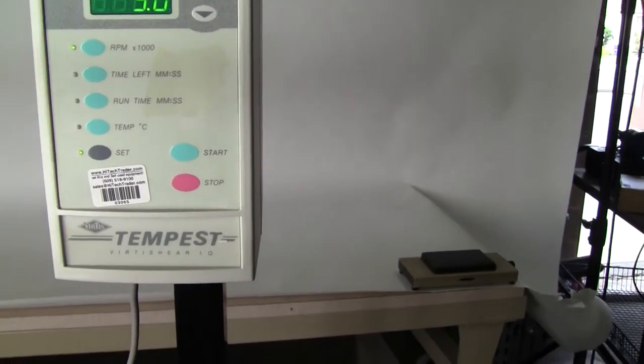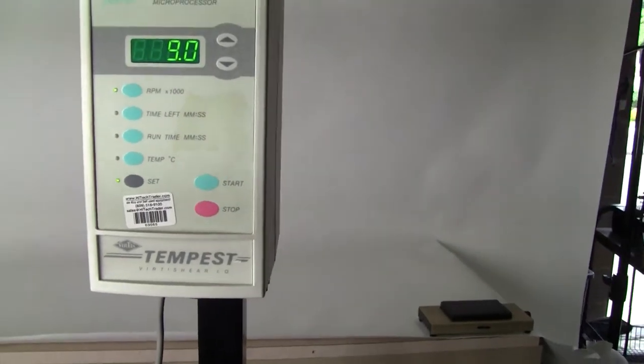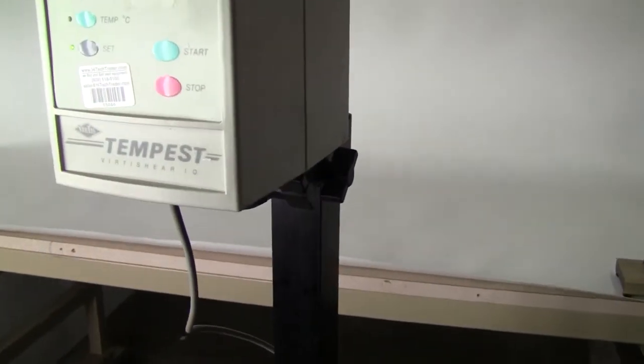You can set run time, time left, and temperature. This particular model comes with a stand but it does not have a stator.